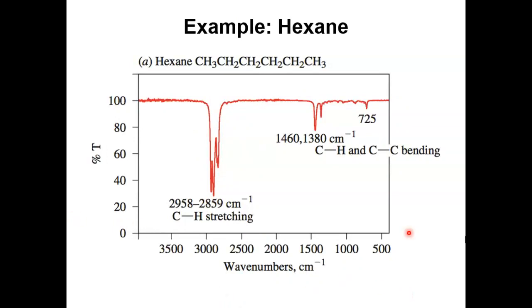And the x-axis is the frequency, but in infrared, due to historical reasons, it is given in a unit called reciprocal centimeter. It is a frequency unit.